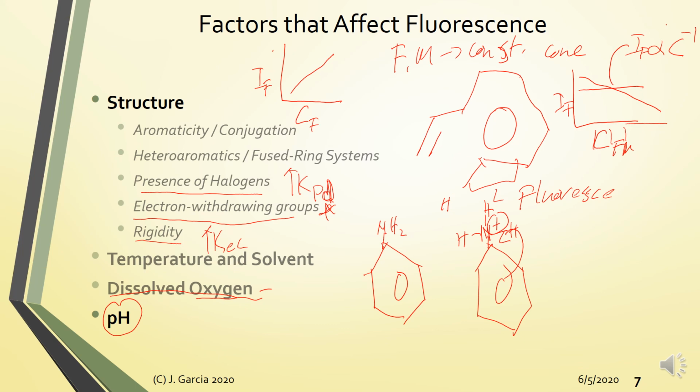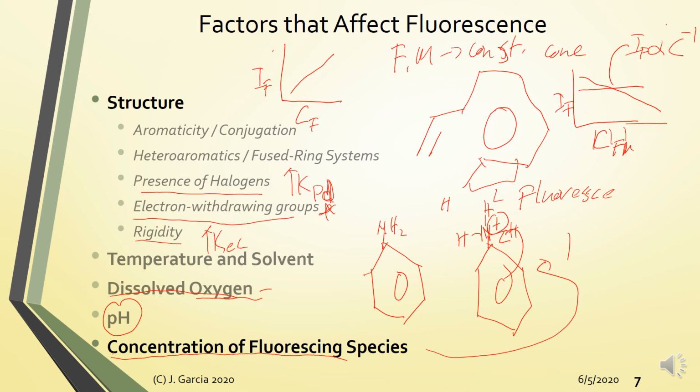And finally, of course, the concentration of your fluorescing species. As we've shown earlier, there is a direct proportionality between fluorescence intensity and analyte concentration.